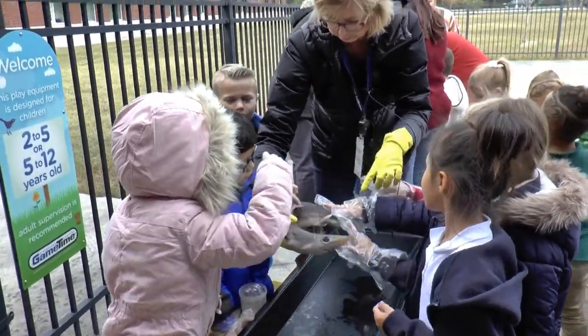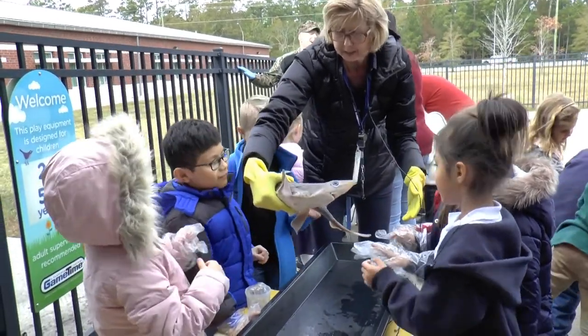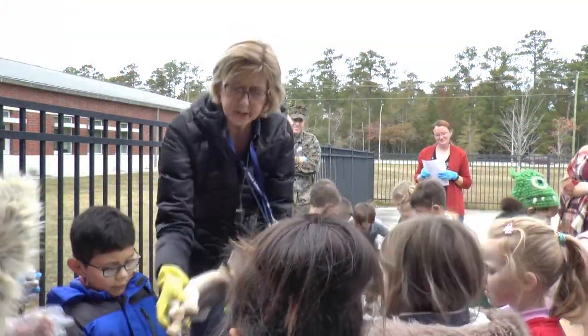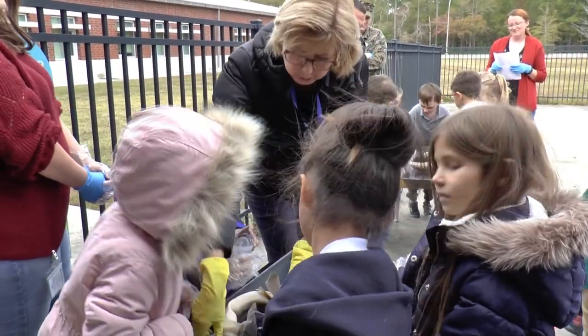That's the dorsal fin. Okay, where is the caudal fin? Where's the... no, caudal's in the back. It's the tail. The caudal fin's in the back, the tail. All right, we're gonna turn our sharks upside down now that we've found all the parts.